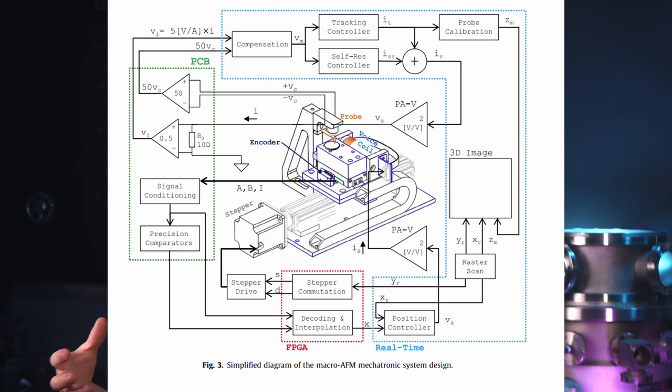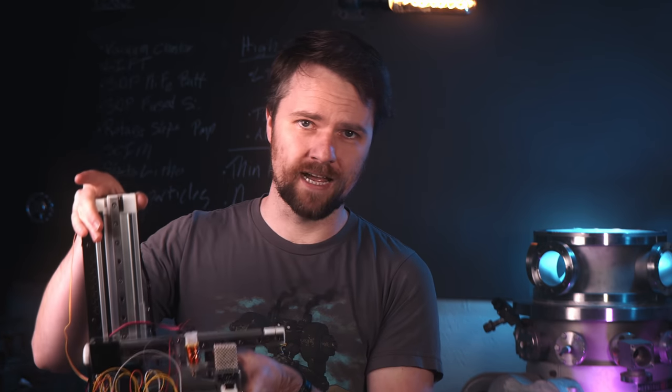This macro AFM is actually based on a paper from an MIT graduate course. They build a much more advanced version for the course. I took that concept and distilled it down to essentially the most bare-boned system possible. The macro AFM is cobbled together out of an old 3D printer, so it has probably a 150mm cubic volume and about 0.1mm step size — so 100 micron XYZ resolution.